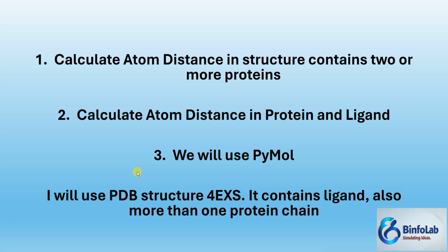We will cover two basic points. First, we will learn how to calculate atom distance in structures that contain two or more proteins. So, in what scenario may you have these structures?